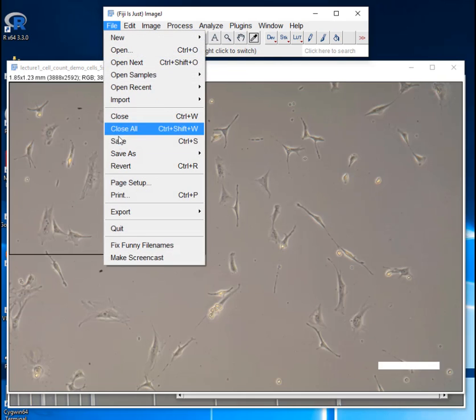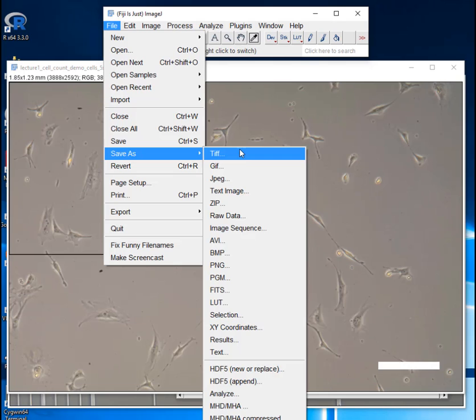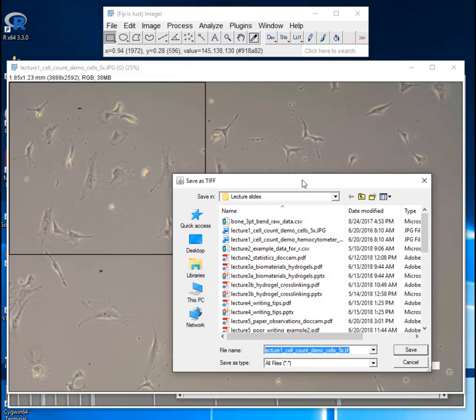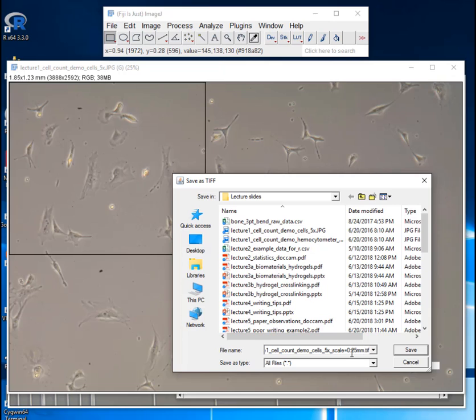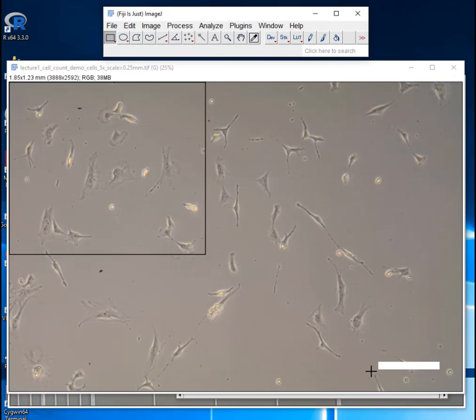And so I'll say file, save as, maybe it's a TIFF file. And so I'll just put right at the end of the file name scale equals 0.25 millimeters. And that way I'll know from the file name how big that scale bar is. And so that is how you can handle all the cell counting with ImageJ for BME245L.